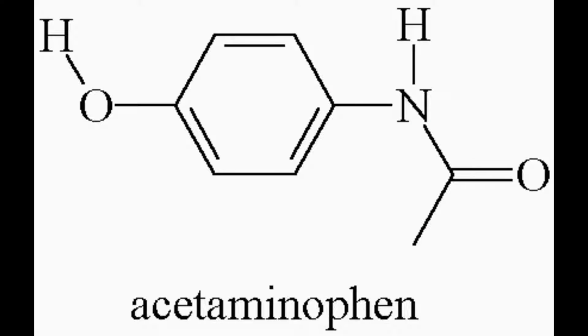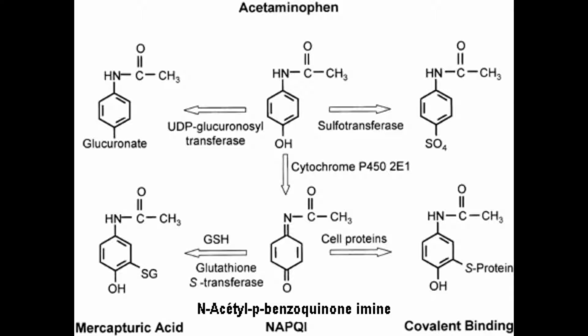The Tylenol solution slows the reaction because it contains acetaminophen, which inhibits catalase. In a functional human body, when there's a buildup of acetaminophen in the liver, the primary pathway to eliminate the byproducts is blocked and they are forced to take an alternative pathway. This creates NAPQI, which is a toxic compound. The reason for the Tylenol solution and ethanol being the slowest reaction is because alcohol interferes with the way the liver processes acetaminophen.